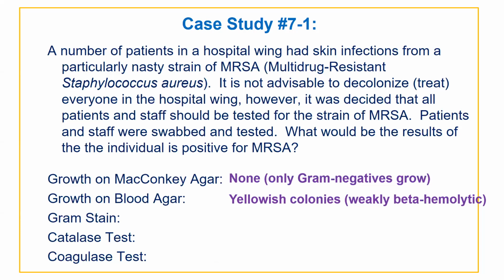Purple, yeah. So we're going to talk about gram stains in a minute. We've a few times already. We're going to get into more detail today, hopefully. So it's going to be purple. And that's not enough. You got to tell me what you see. It's going to be a staphylococcus, so round cells, and they're going to be clustered in most cases.